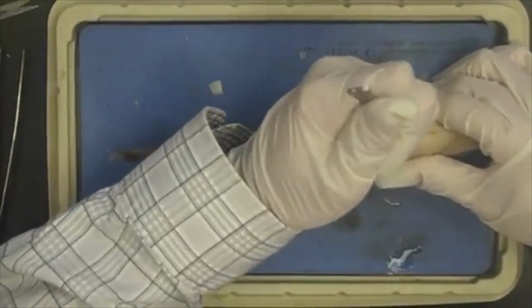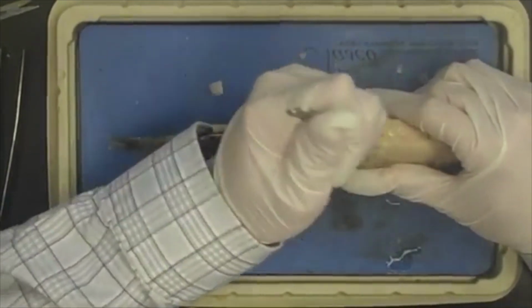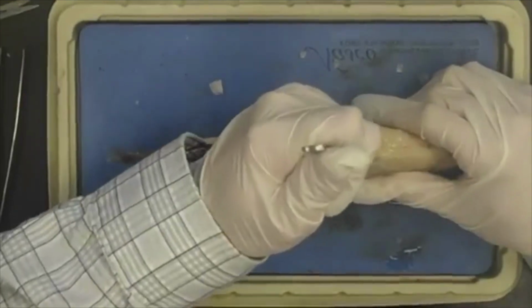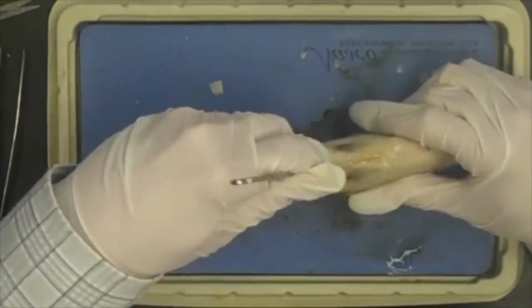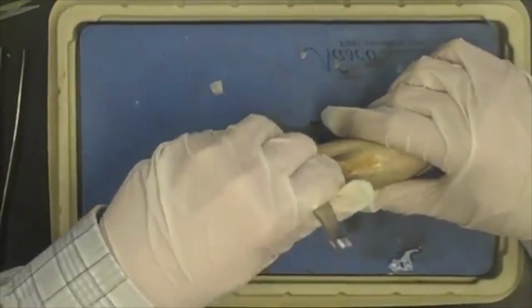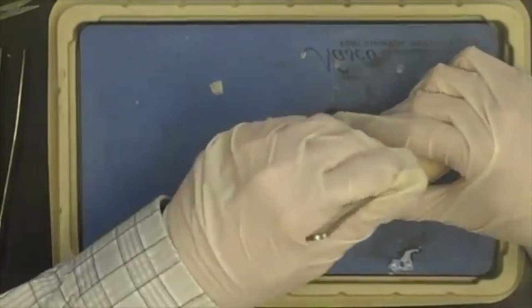So as you can see in this video, I'm beginning by using my scalpel to make an incision along the ventral portion of the underside of the fish. You want to make the cut from just behind the pectoral fin all the way to the anal fin. Once you've done that, run the scalpel through a few times to be sure that all the layers of tissue are severed.